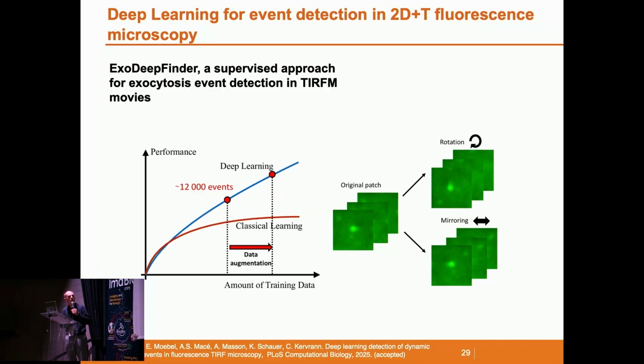We also introduce data augmentation, which consists of applying basic operations to increase the data sets and to improve the performance. Right.